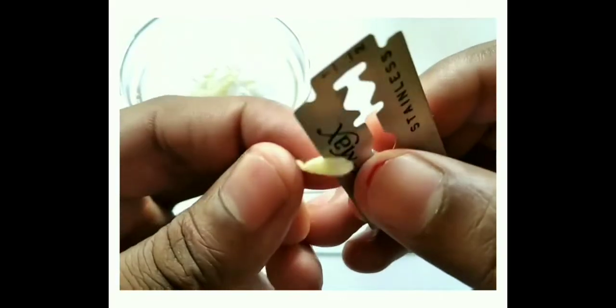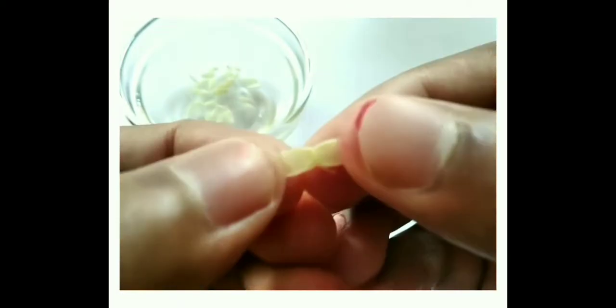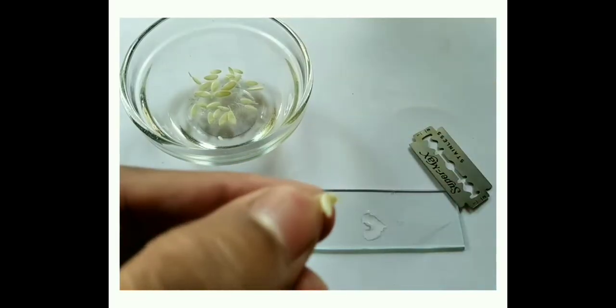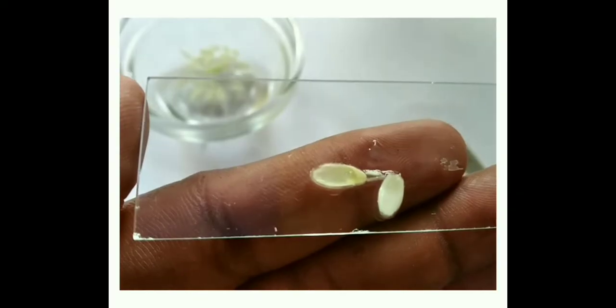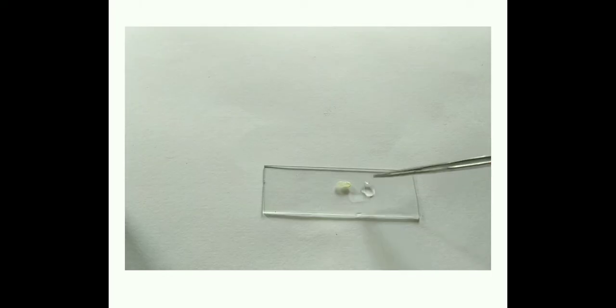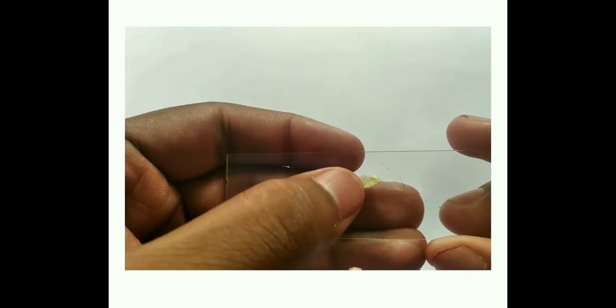The endosperm is generally present at the lower portion of the seed. Be careful — don't damage the endosperm. Here you can see a gelatinous mass present at the lower portion of the seed; that is the endosperm. Transfer this gelatinous mass to a clean glass slide, add a drop of water, and gently transfer the endosperm from the seed to the water with the help of a needle.